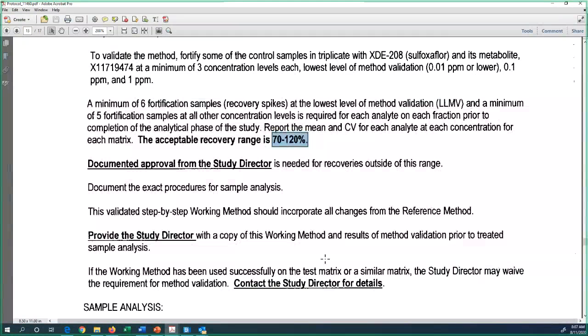That's how we see it, because it affects ionization in LC-MS. Once your sample goes into the ionization chamber, if you get too much sample matrix there, the ion source is limited. For example, if you have 100% ion source ions there, and your matrix occupies 50% of the ions, it will take a certain portion.